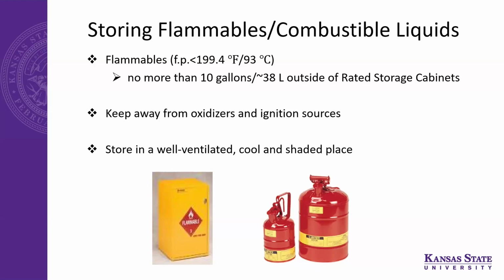So for those on the Zoom call, the question is oxidizers and flammables: what are you going to do in the lab when you have that going to a reactor situation? NFPA is a big one. The Compressed Gas Association is another one that we'll be using behind the scenes to figure that out based on your operation. Good question.